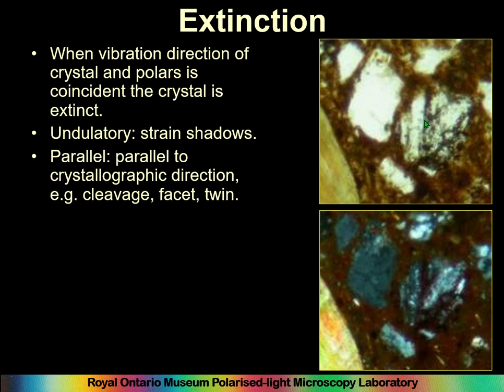There is parallel extinction. So this will be parallel to the crystallographic direction. So that means it's not a monoclinic or triclinic mineral, and it's becoming extinct in the same direction as, say, a cleavage in the mineral, or facet of the crystal, or a twin, if it has a twin in the mineral.